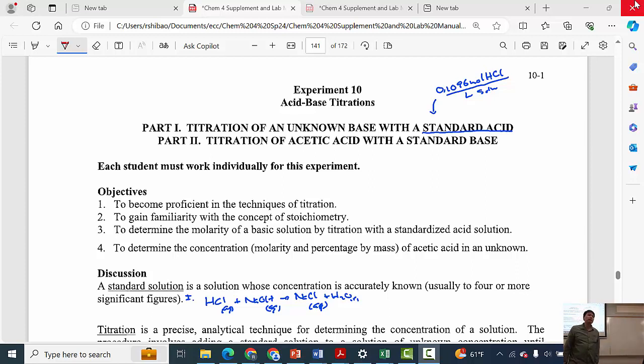We do have one way to tell. We have a dye or an indicator called phenolphthalein. You might have used this last week. Phenolphthalein has two colors. In acid, it's colorless. In base, do you know what color it turns? Pink. Right. And so we can tell this. What we're going to do is start off with the acid in our flask.